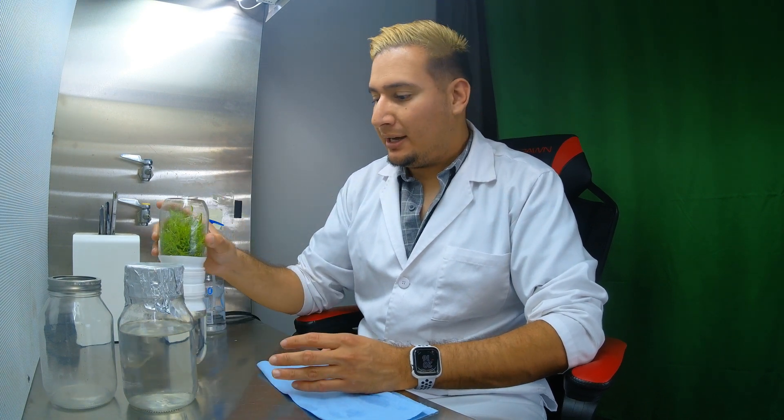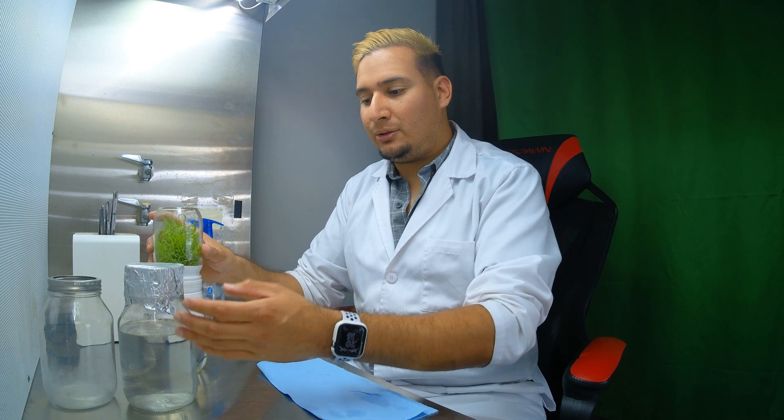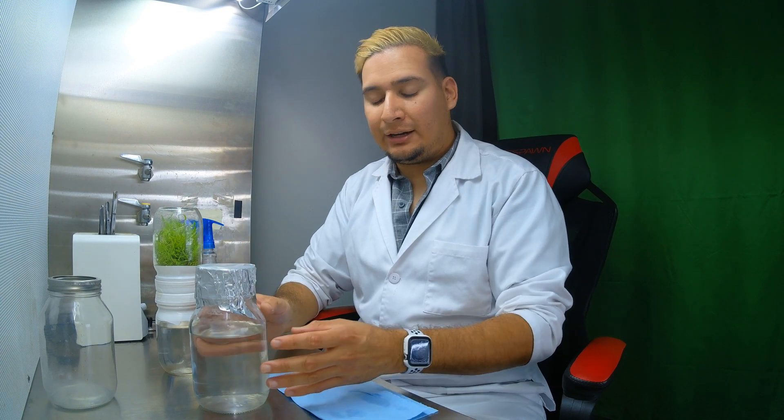But for now I want to move it into the big 32 ounce canning jar. So what I did already, I already made media and then I sterilized it. Now the reason I have the two flats right here is that if I have the whole thing, it's too tall and it doesn't fit in my pressure cooker.